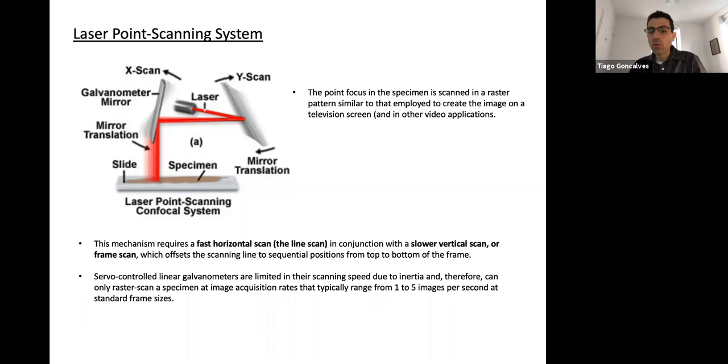So usually you pump in a control voltage, and the voltage gets converted into a current that basically makes these mirrors oscillate. Now, they are limited in their speed, and this is a very important factor to understand: the imaging methods we have for imaging activity are generally much slower than electrophysiology.